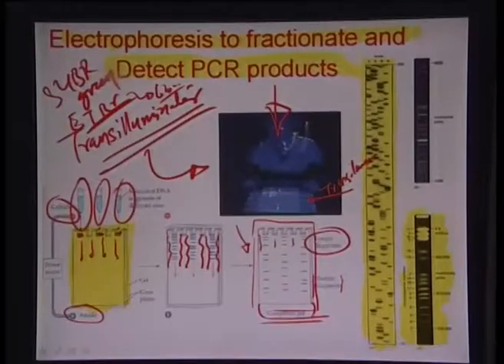So here is a person who is trying to read out what is there on a gel by looking at the sample placed over this transilluminator. This is what the transilluminator would look like, and you have to be careful while reading out a gel in a laboratory, protecting your face, because UV is also damaging to the epithelial layer of the body and can cause skin cancer. So you have to be careful about your wear and your safety mechanisms before looking through such a gel illuminator, transilluminator.